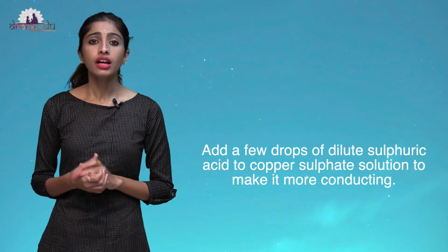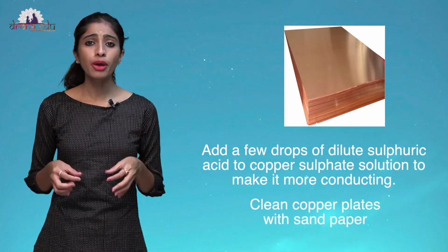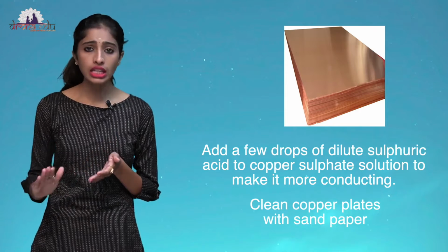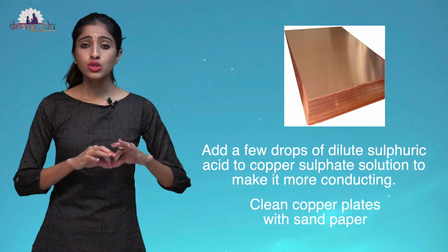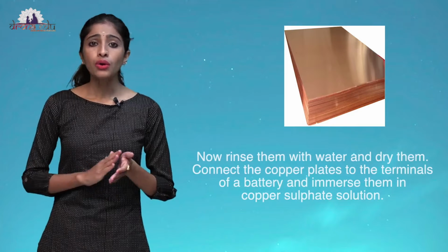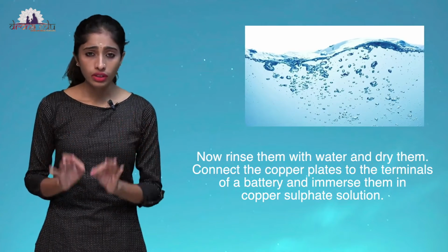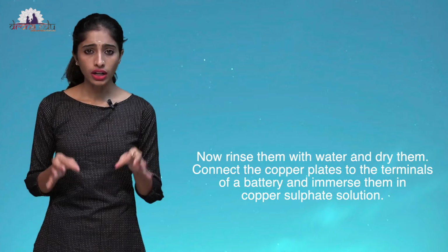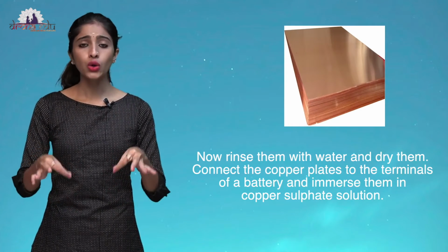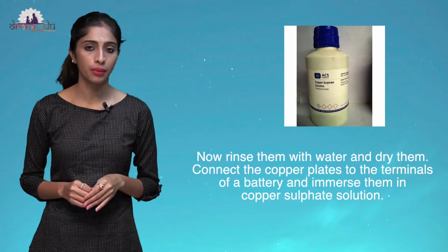Did you understand? Clean the copper plates with sandpaper. You have to clean them because there will be oxidation on the copper plates, so that there will be no oxidation on the plates. Now rinse them with water and dry them. Now connect these copper plates to the terminals of the battery and immerse them inside the copper sulphate solution you have prepared.